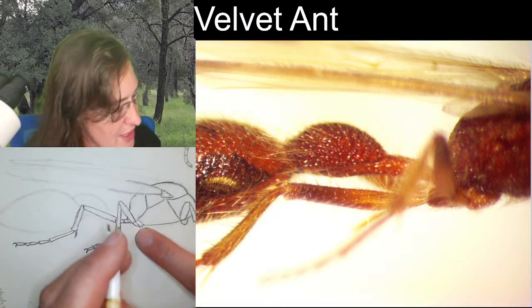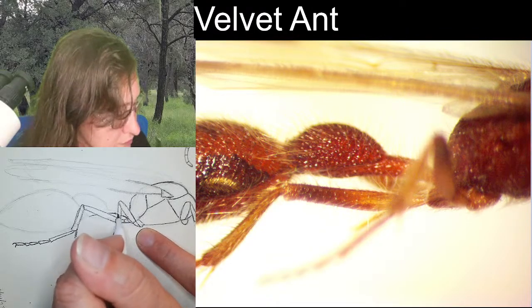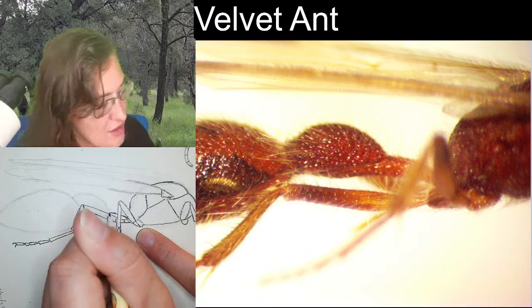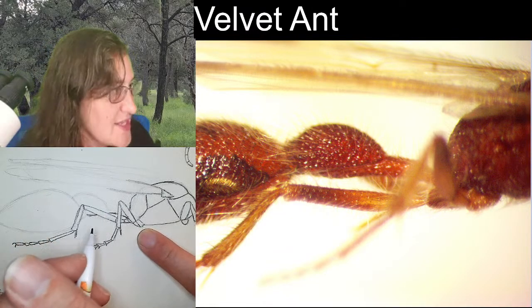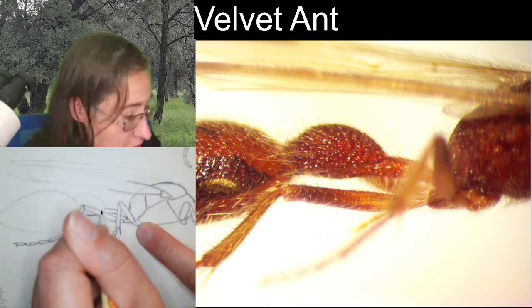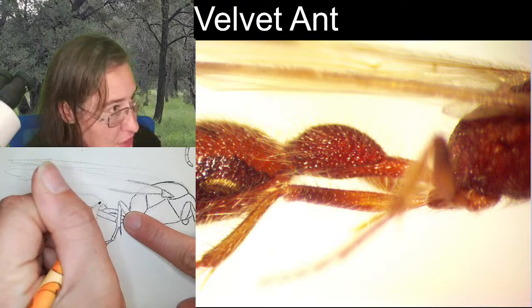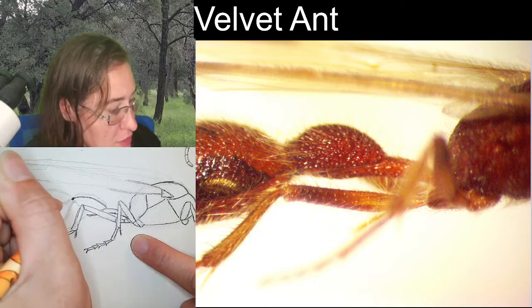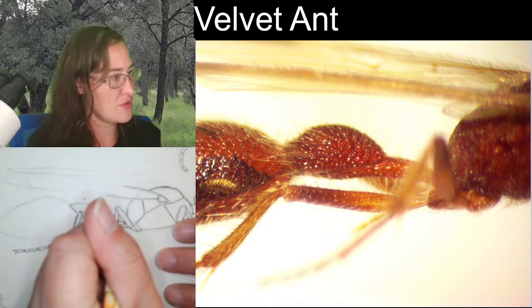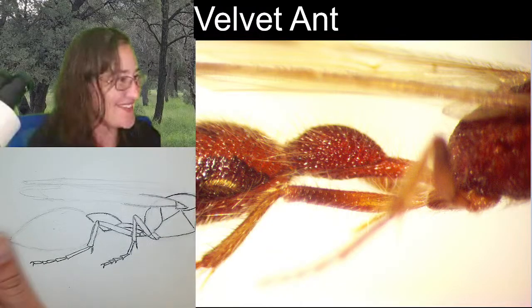Let's see. Alright, so I'm rounding this line kind of up, but trying to work around these legs. Okay. Alright, so that's going to be the bottom line that I have, and then the top, narrow at the base, a little bit wider, comes up. There is a little bit of a suture here that creates one kind of segment, and then this one on top. Sort of like that. He's so cute. I do love him. Alrighty.